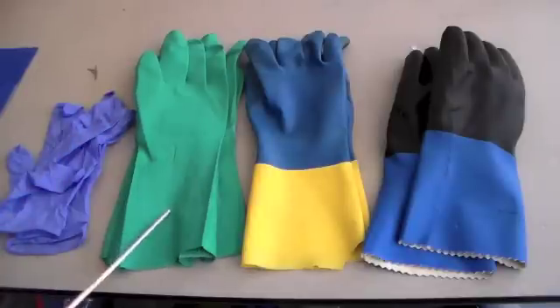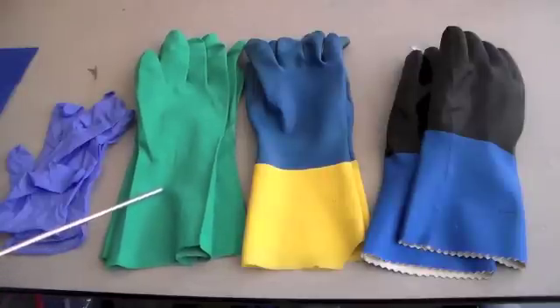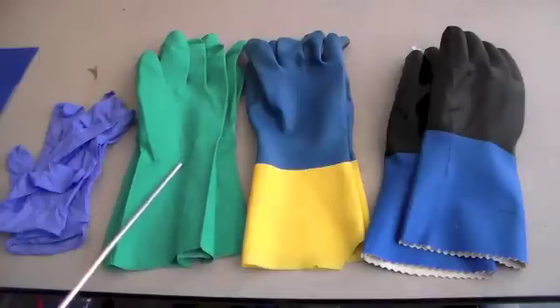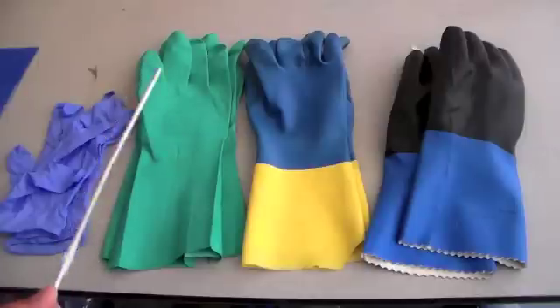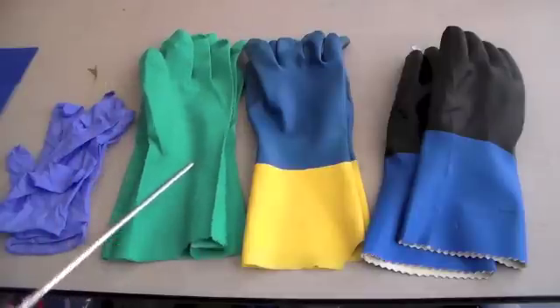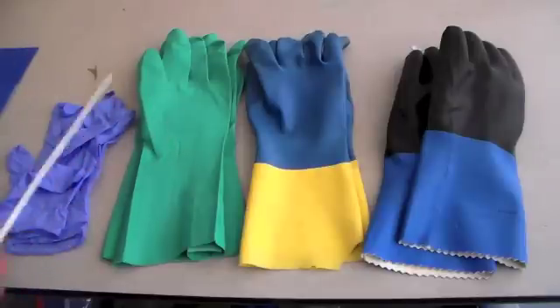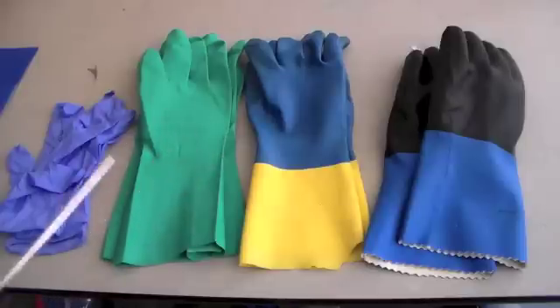Next, we have heavy duty nitro gloves, and these are not disposable — well, they could be if you're really wealthy. These can be used for very corrosive or caustic acids and bases. This type can withstand 98% sulfuric acid. They can also be used for aqueous halogens, and I'm assuming that if it's resistant to aqueous halogens it can also be resistant to pure halogens, although bromine would probably eat through it. Just don't work with halogens.